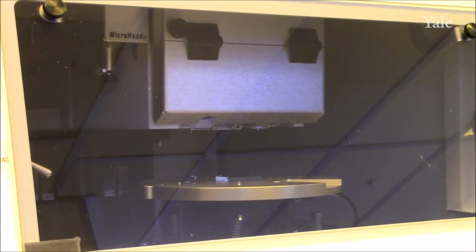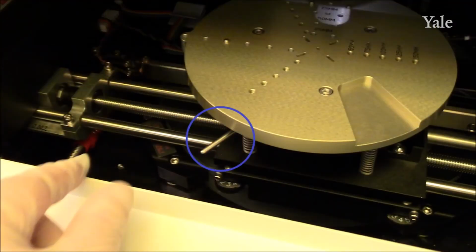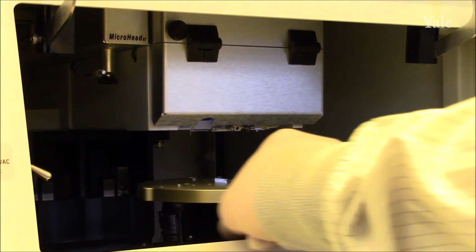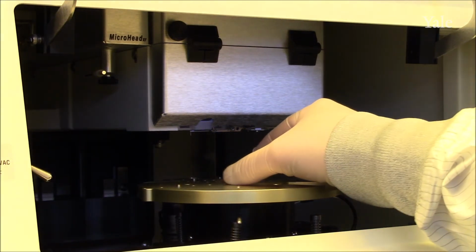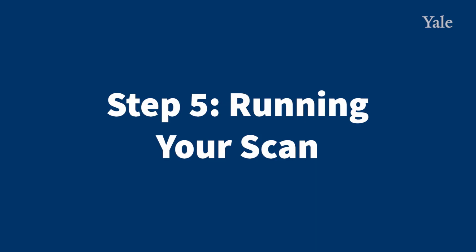If you need to rotate your sample, be sure to press manual load to bring it to a safe location first. At this point, you can adjust it using the lever. Make sure that when you're done adjusting it, the sample is resting on one of the stop points and isn't going to vibrate. You should feel a small click when you are at a stop point.